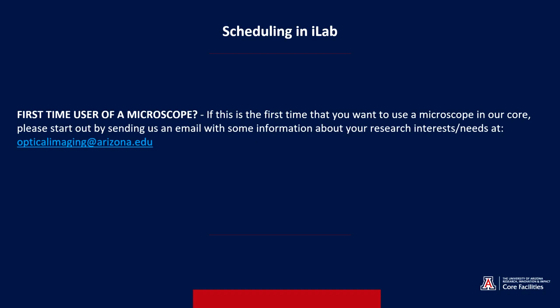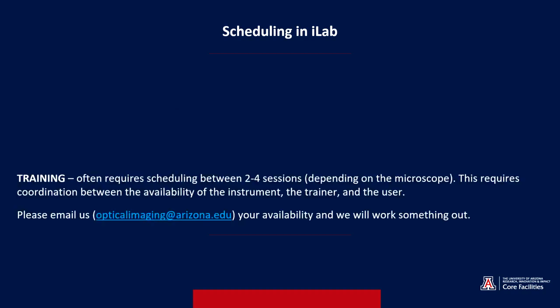If you're a first-time user of a microscope in our core, we would love to correspond with you or talk to you in person or on the phone to get some more information about your research and your interest and your needs, and make sure that you're pointing yourself towards the correct microscope to do the best research possible for what you're trying to accomplish.